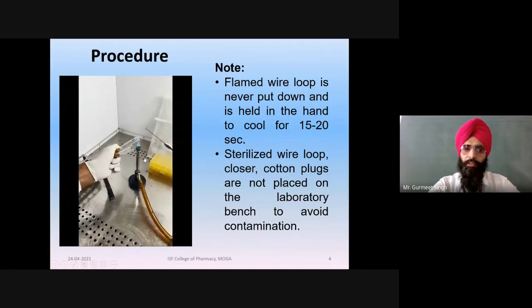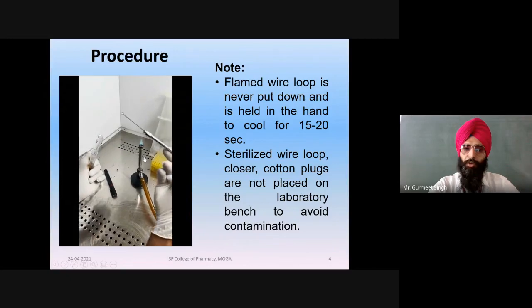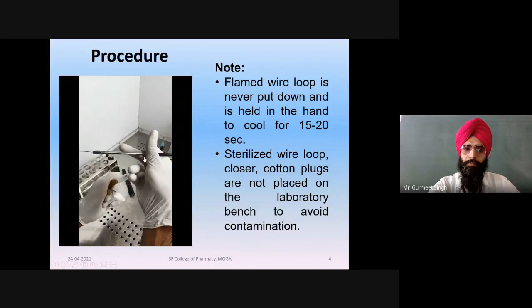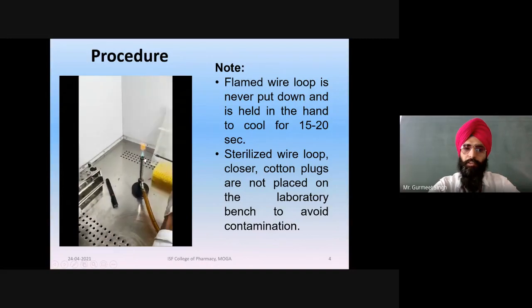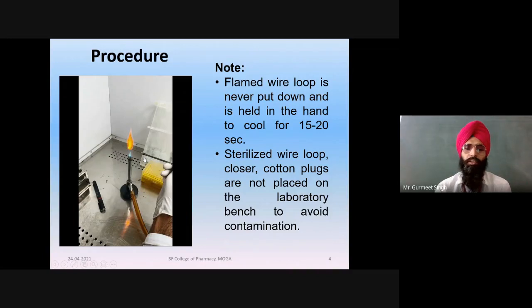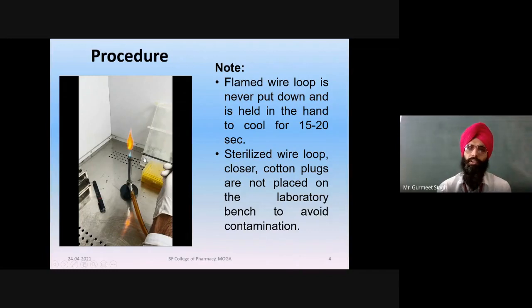After that, again flame the mouth of each tube and cap with the help of the cotton plug. Finally, sterilize the inoculating loop again. We sterilize it again because the microorganisms transferred from the bacterial suspension tube to the nutrient agar tube should not contaminate other persons or surfaces.